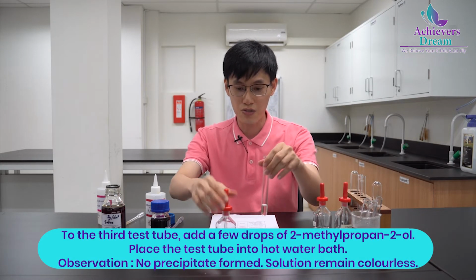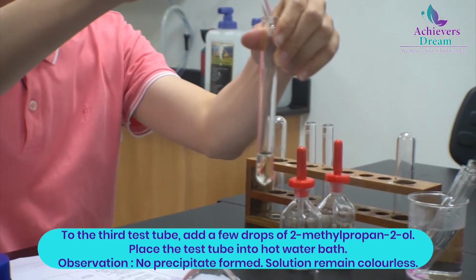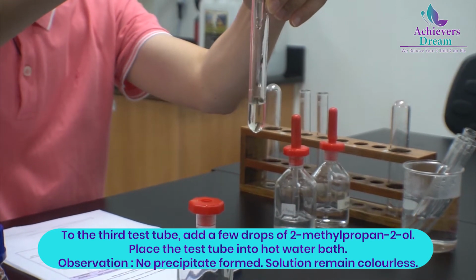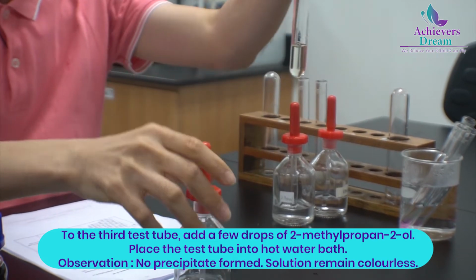And last, we have the tertiary alcohol, 2-methyl-propan-2-ol. This alcohol doesn't have the iodoform group, so we don't expect to see any precipitate at all. And indeed, no precipitate appears.